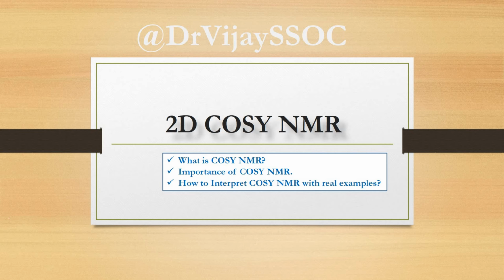Today we are going to discuss a very important NMR technique, which is two-dimensional COSY NMR. By the end of this video, you will understand what COSY NMR is, what its importance is, and how to interpret COSY NMR with real examples. So let's start this video.